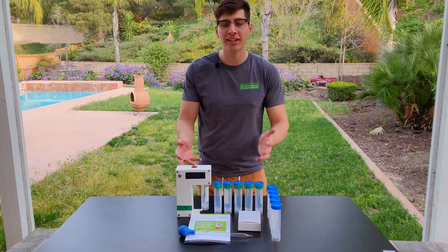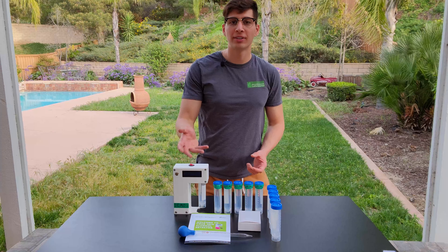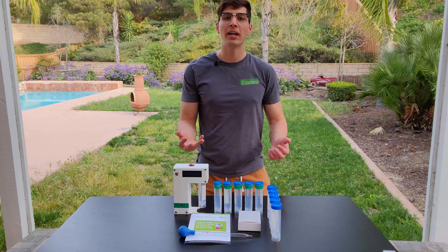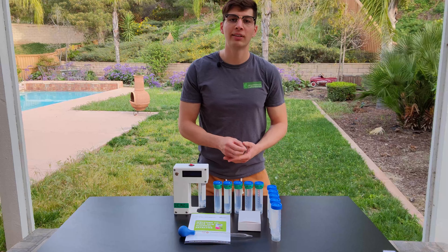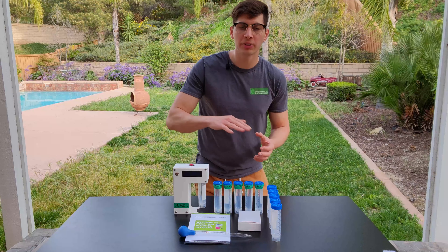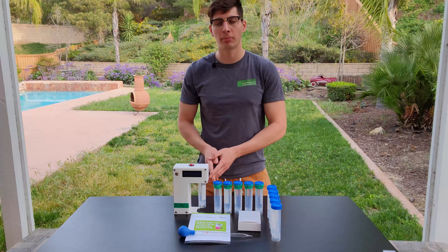This is a simple one-time purchase and you don't need to buy any extra equipment or reagents. Once you have this device, you can measure alcohol content as much as you want. You measure a few alcohol standards in the machine, type their readings into an Excel document that I provide, and then build a calibration curve that allows you to measure all of your samples and get the alcohol percentage.